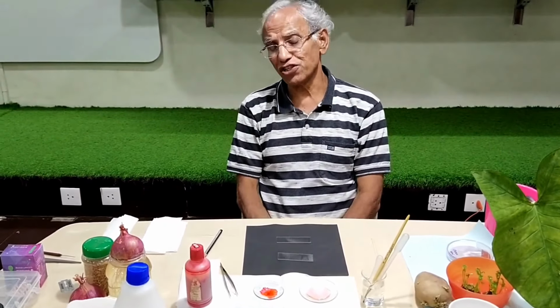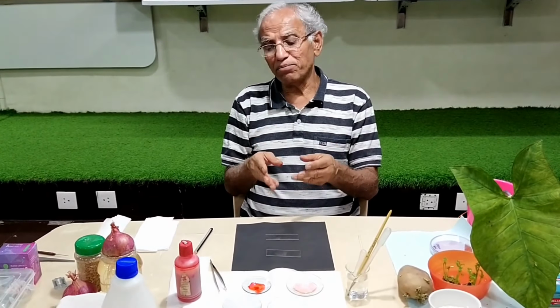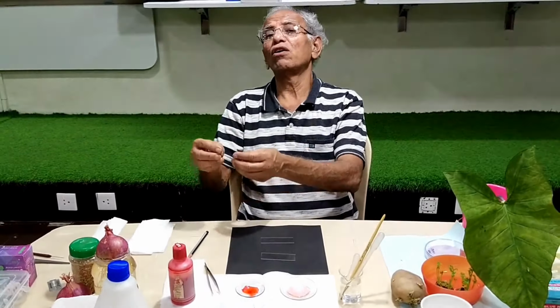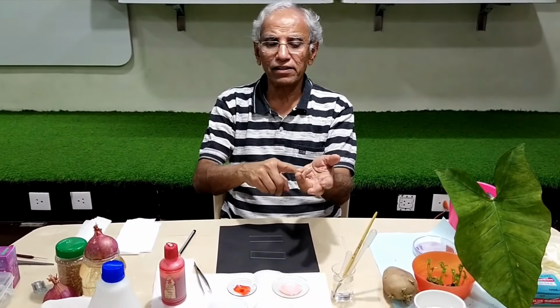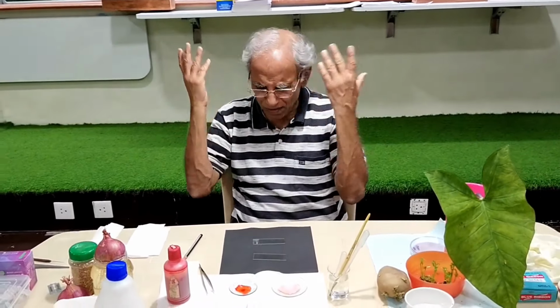Already it is a preserved thing. Preservation is a kind of fixation. I'm introducing to you a term, fixation. Not all tissues will require fixation, but animal tissues usually will require fixation. So when things are kept in acetic acid or alcohol or formalin or a mixture of these, which three things have I said? Acetic acid, formalin, alcohol, you can make possible mixtures of these and put it there. It was already kept there for years, and it is now fixed.